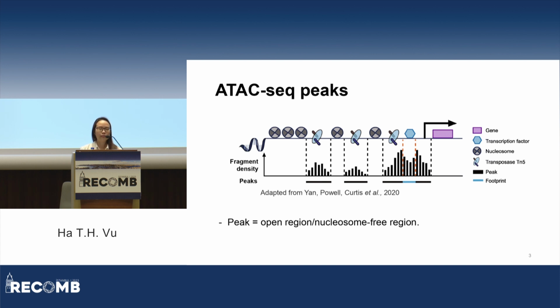The downstream step would be to quantify and to determine the significance of the read pile-ups in the genome. And this process is typically referred to as peak calling. And the peak regions mean they are open, or they could be called nucleosome-free regions.